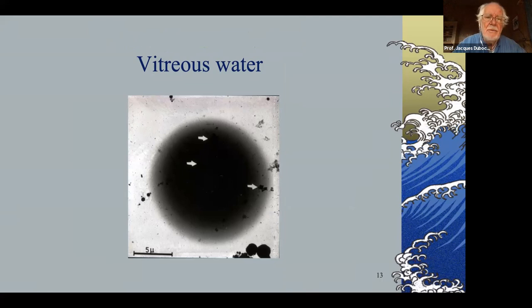And we didn't know what this could be. Was it liquid frozen ethane or what? No, it could not be ethane because at that temperature, minus 170, ethane would be gone. So we thought, okay, we will see how this stuff evaporates. So we stopped cooling and let the specimen holder warm slowly. It took about a quarter of an hour, a bit more.